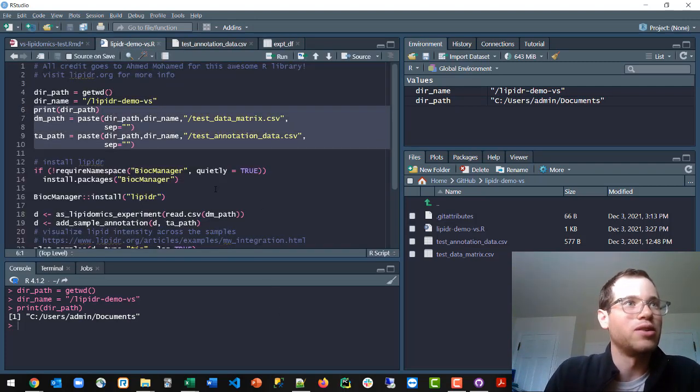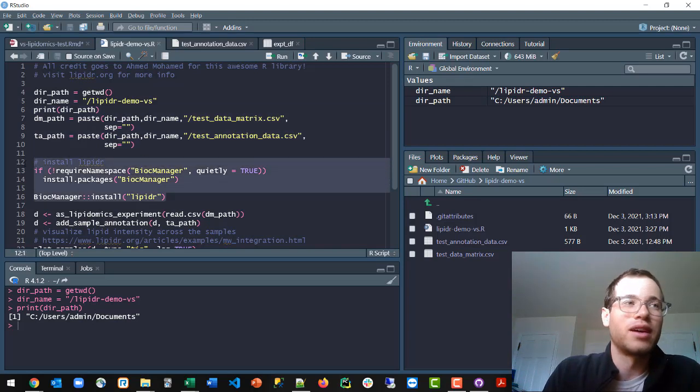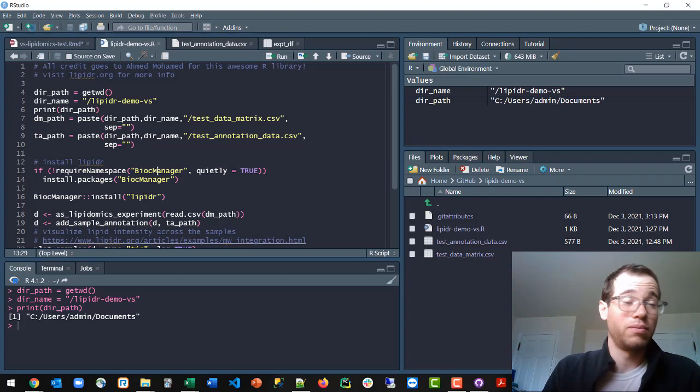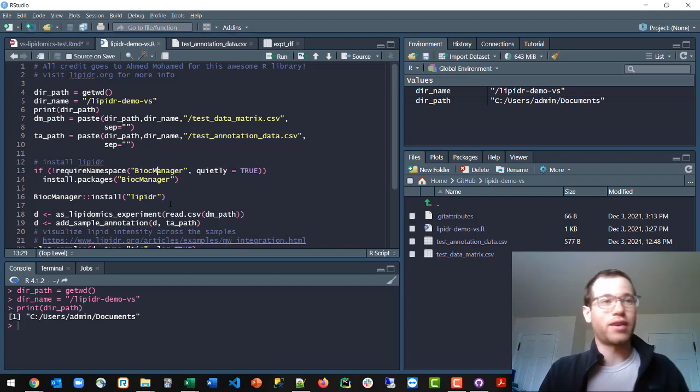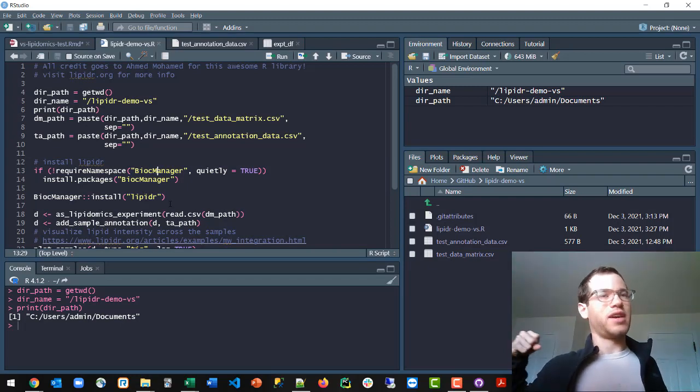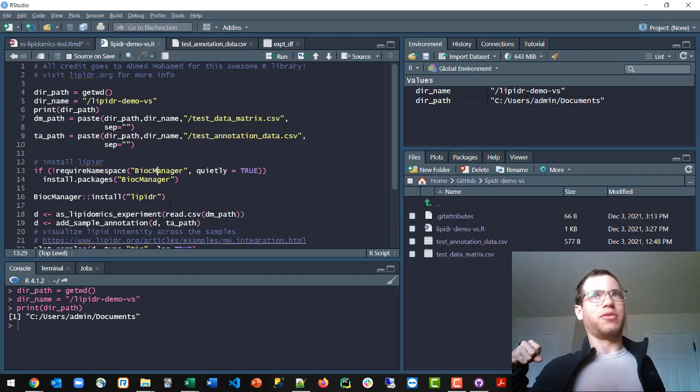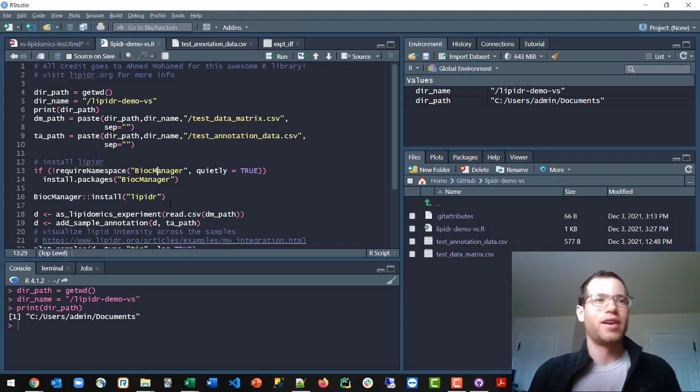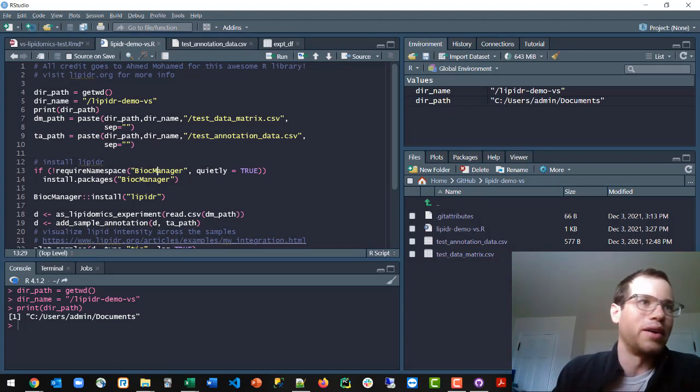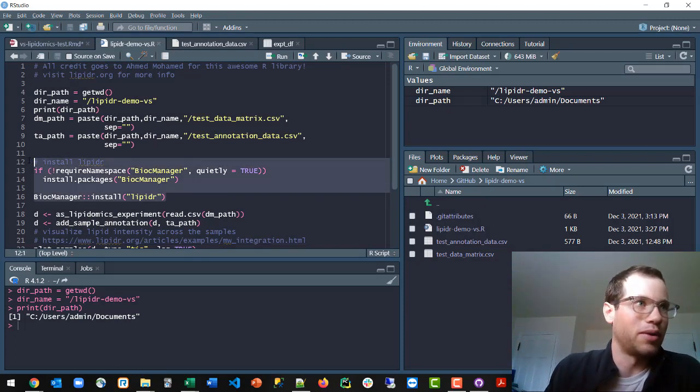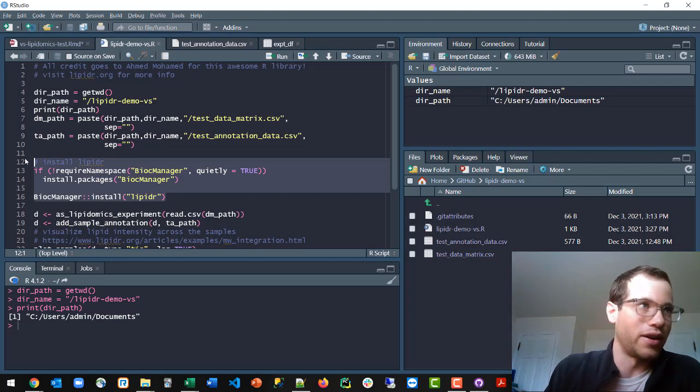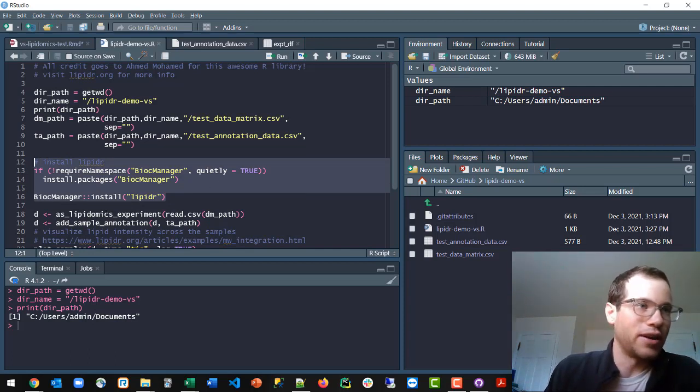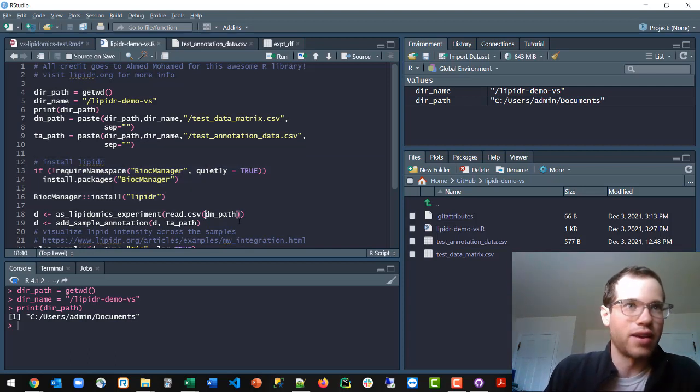Now what we do is, if you haven't already done this, these are the lines you run to actually install the lipidr package. So you use the bioc manager to initiate this process. So it's kind of like pip in Python, I believe. But basically, I've already done this, so I'm not going to run it. But if you haven't done this before, you would run lines 12 through 16 right here.